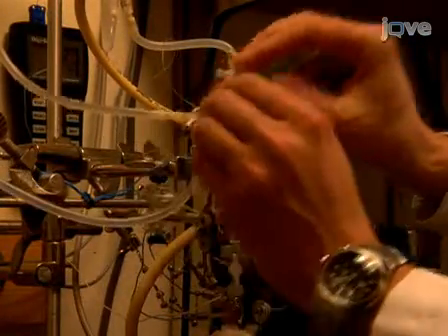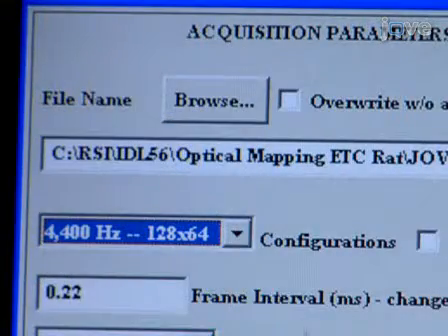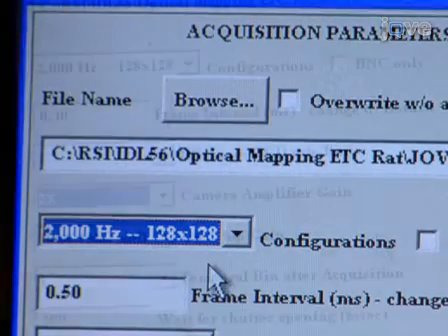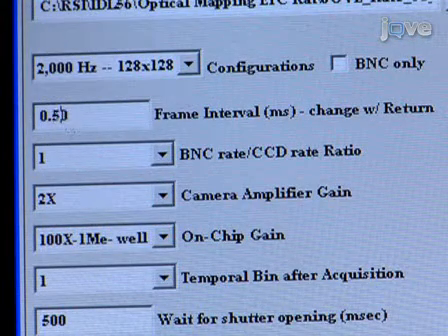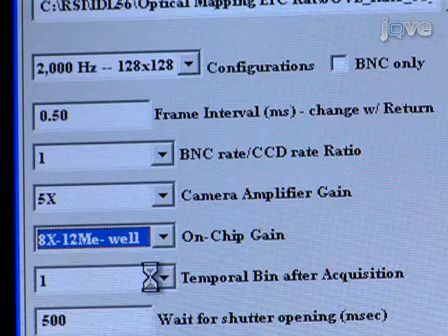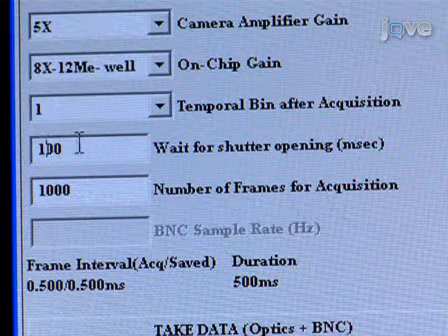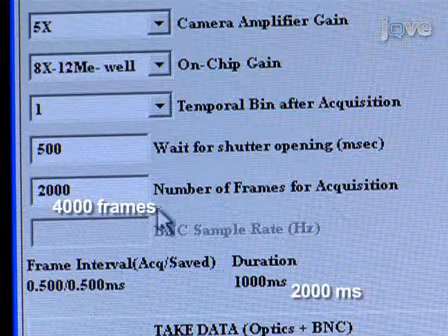Between acquisitions, perfuse the heart with unadulterated Krebs-Henseleit to help preserve the viability of the preparation. Configure the software recording parameters to 2000 Hz with a 128 x 128 pixel array. The frame interval should be set to 0.5 ms, gains set to 5x for the camera amplifier and 8x for the on-chip gain. The on-chip gain should also be set to 12. Set the software's camera control for a shutter delay of 500 ms and record 4000 frames at a duration of 2000 ms.